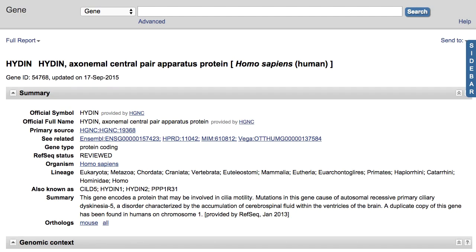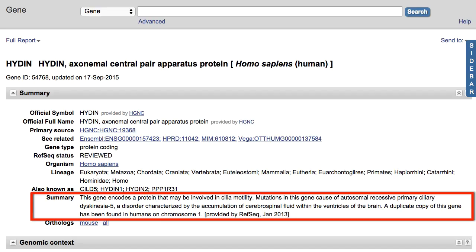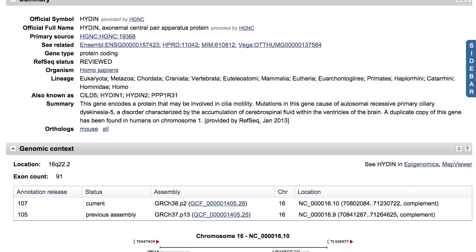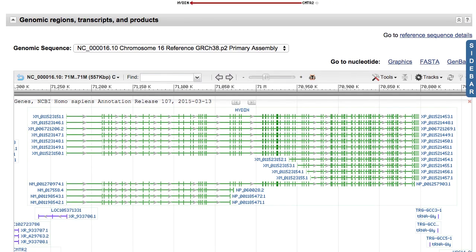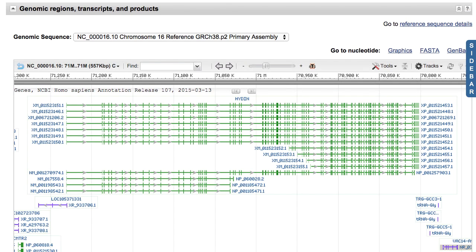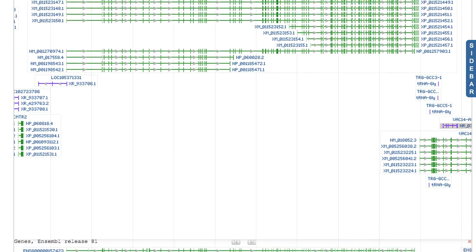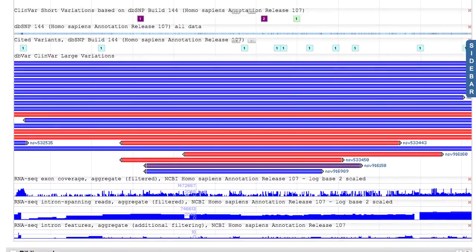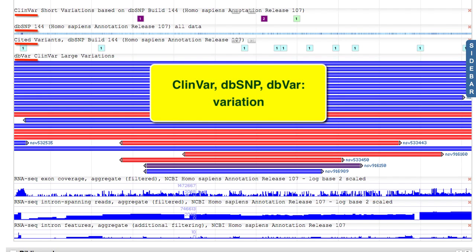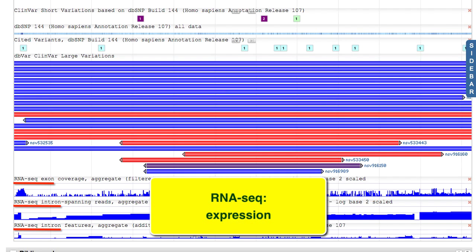I'll start in the gene record for Haydn. The Haydn protein appears to be involved in cilia motility, and mutations in the gene are associated with accumulation of cerebrospinal fluid in the brain. The Sequence Viewer display provides a graphical view of this genomic region, and the default tracks provide information about annotation, small and large scale variation, and expression.